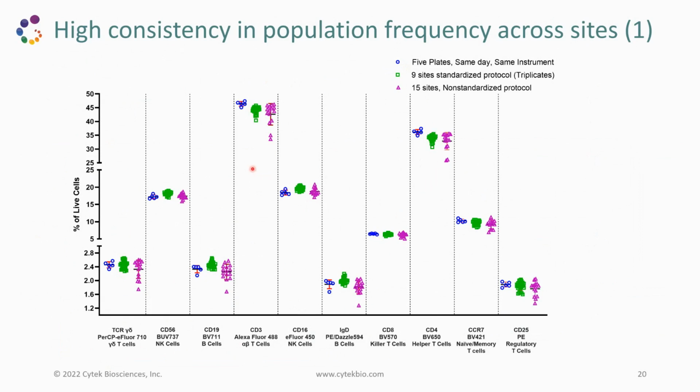And as we relax the conditions on the sample end, that distribution starts to widen, which is expected. So the green allows us to focus on exactly what the contribution of the instrument is, and the purple shows that minimum variations on the sample end are going to show you a bigger distribution, but it's not because of the instrument, it's a contribution of the sample.